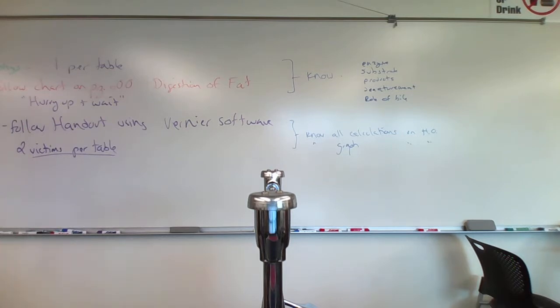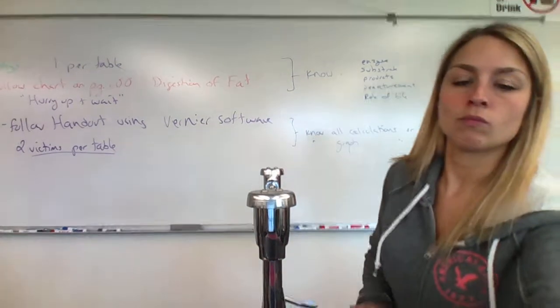So you're going to add basically the combinations herein. You're going to let them incubate for an hour at their appropriate temperatures, and while they're incubating, you just sit there and twiddle your thumbs. We'll go to the next lab. And then after an hour, you're going to look for the color change of the litmus cream. Litmus cream will be a purplish color when it goes in. After an hour, it will change color due to pH changes, and that'll tell you that something changed. You're going to have to remember biology 112 to think about what that all means.